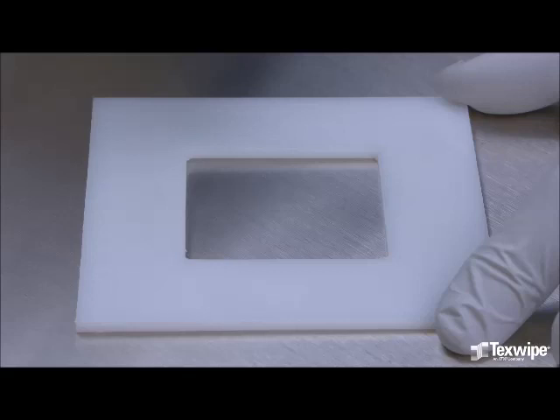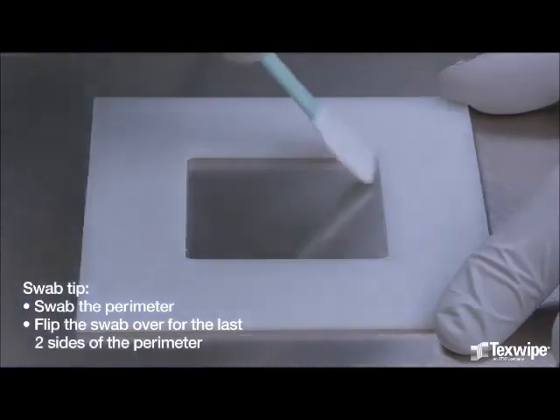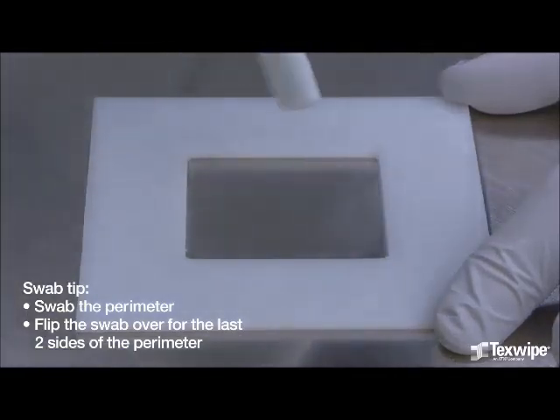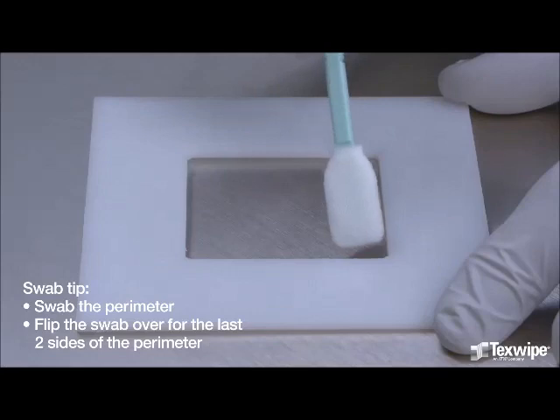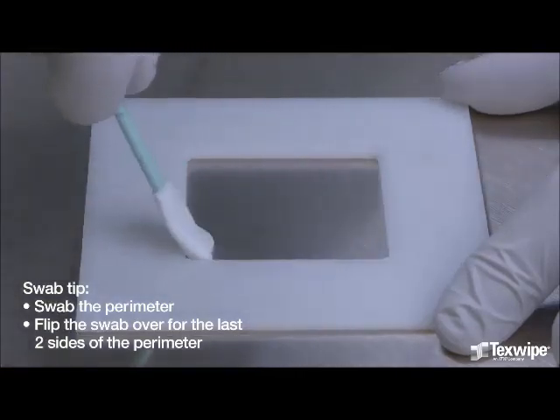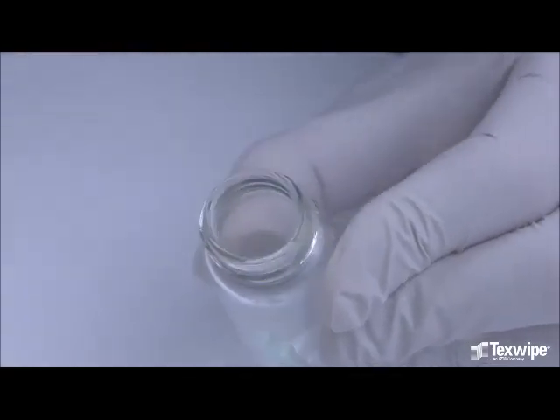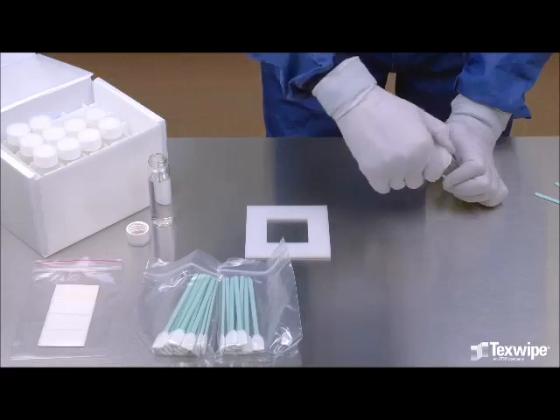The last step is to swab the perimeter of the area using the swab tip. Flip the swab over for the last two sides of the perimeter. Snap the swab head at the notch and allow the second swab head to fall into the same vial. Replace the cap and label the sample.